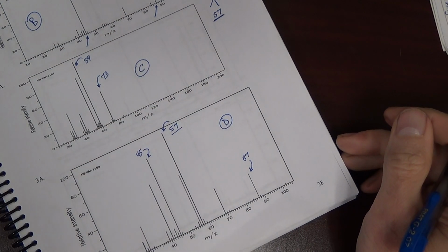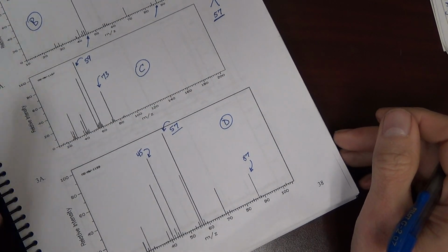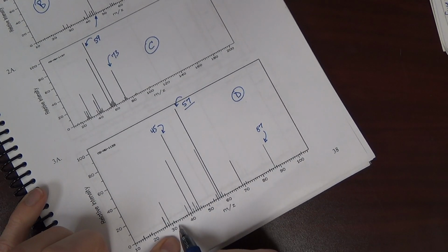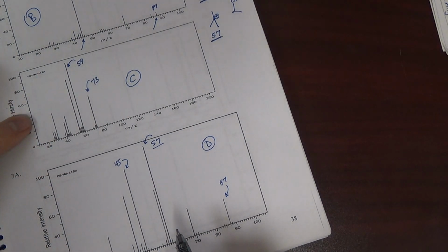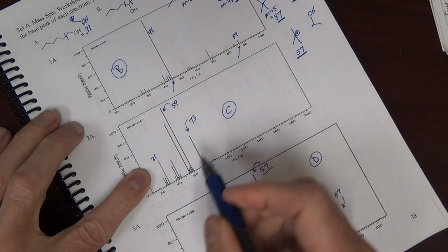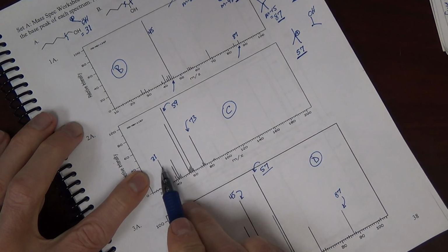So B, C, D. Does that mean that A is not assigned? For A, we predicted 31. There's essentially no 31 in the last spectrum. There is a 31 in the second spectrum, but again, it's not the base peak.